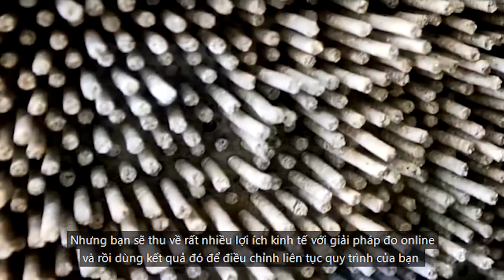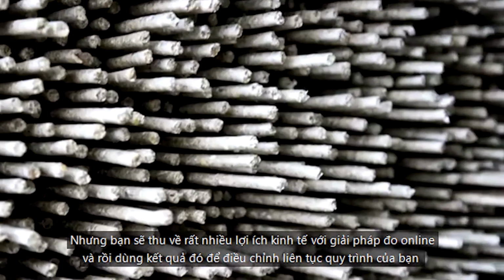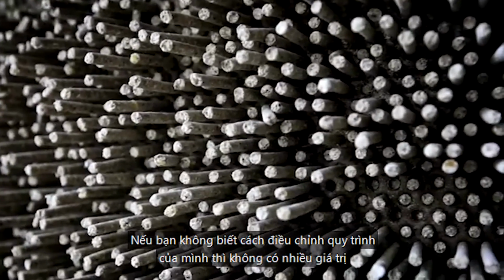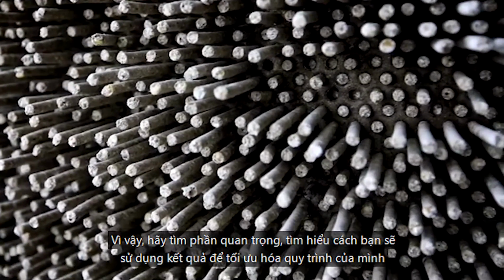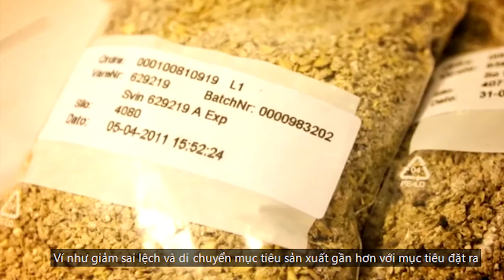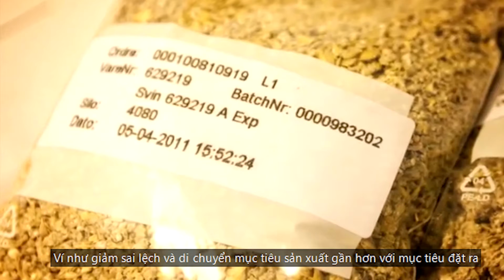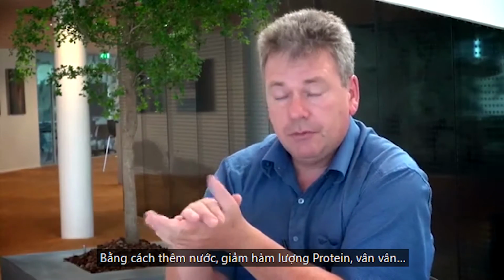To really get value out of an inline solution, you have to use the results for continuous adjusting of your process. If you don't know how to adjust your process, then there's not a lot of value. So find the critical point, find out how you will use the results to optimize your process, maybe reducing the variation and moving the production target closer to the specification. If you want to get the real value out of a process instrument, you will need to react on the results and maybe reduce the variation and produce closer to the specification, or add more water, reduce the protein concentration and so on, by better controlling your process.